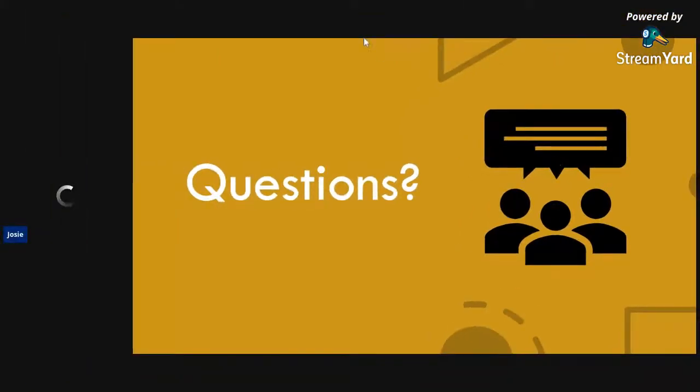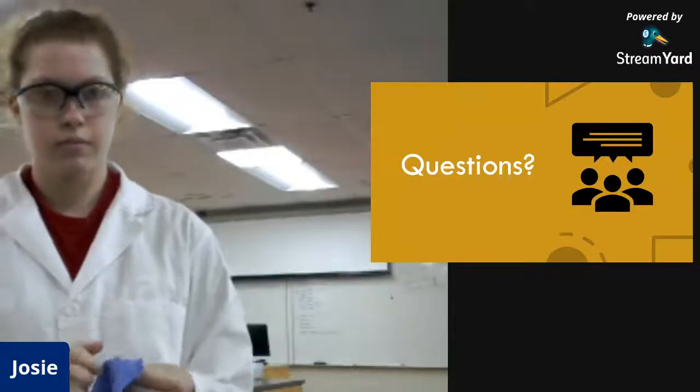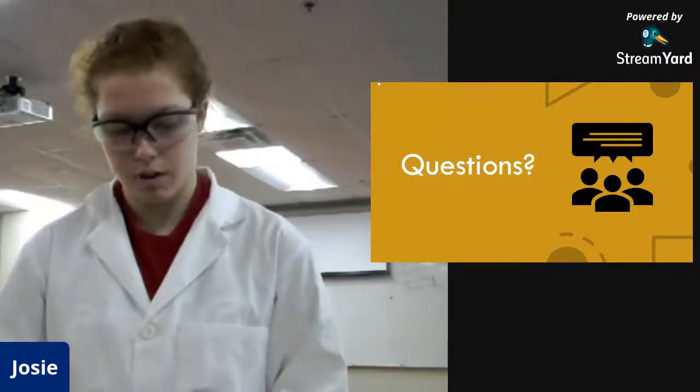Away and answer anything you're wondering. And while you're doing that, I'm gonna light the other steel wool on fire. So I'm gonna put on a glove here. Like I said, when you're handling super fine steel wool, you want to put gloves on because the little particles can get into your skin.